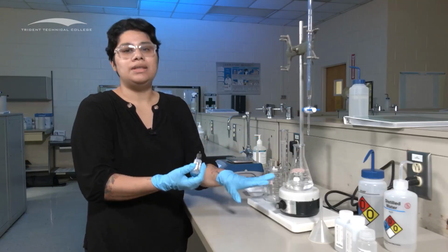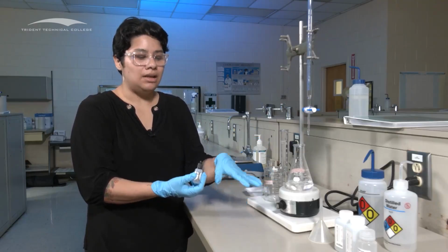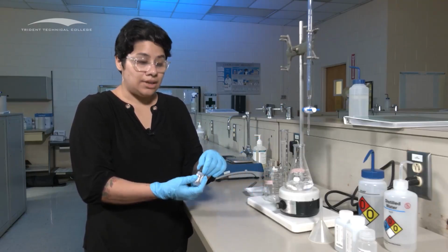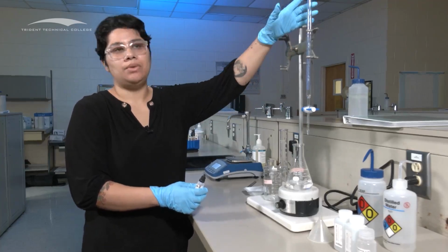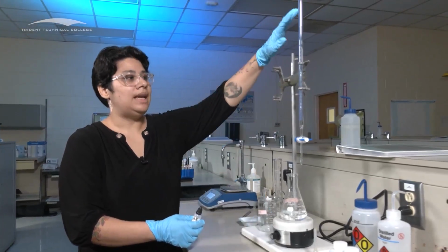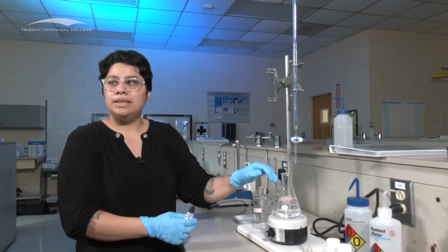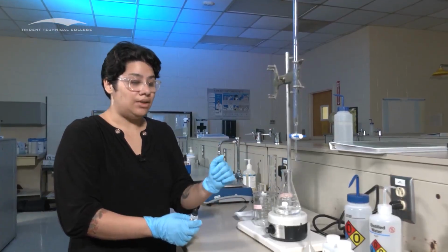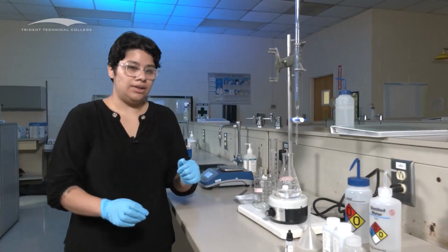And if you did this correctly, that's not going to change color yet. That's going to change color once we start titrating. And when you want to start titrating, so you used the burette before, you want to make sure that your sodium hydroxide is in here, and you're going to titrate slowly, slowly, slowly, because otherwise this is going to change color really fast, and you're going to end up with the incorrect color. So there's 3 colors that you're going to see.